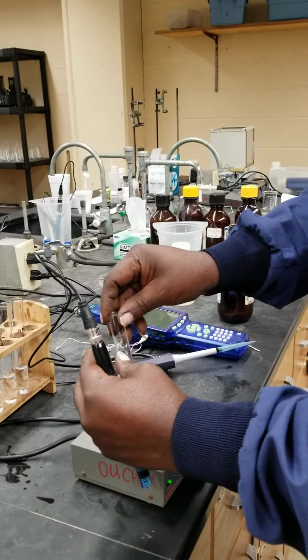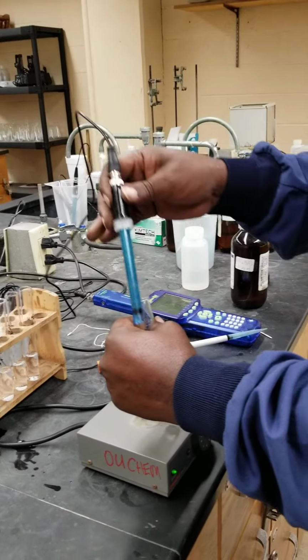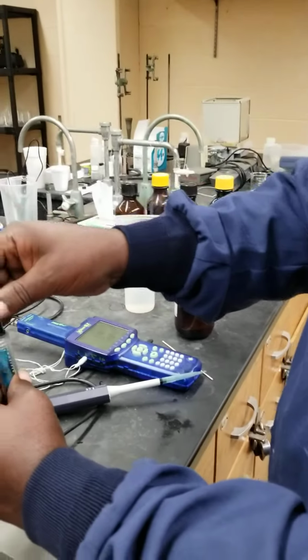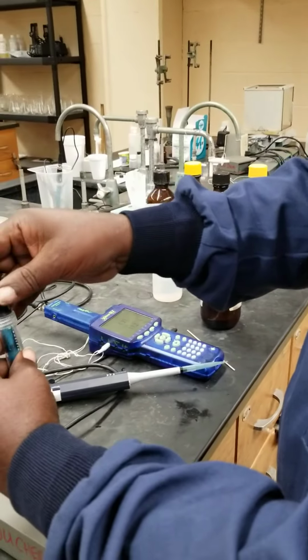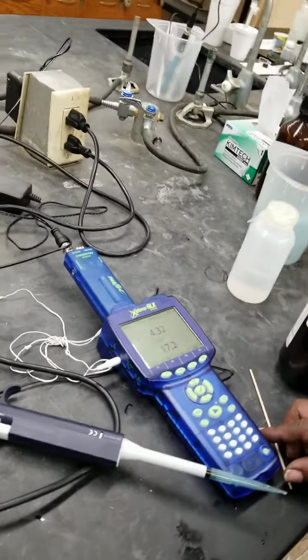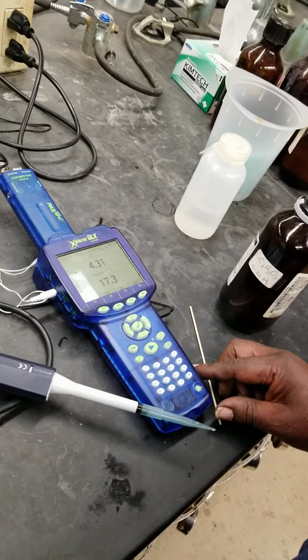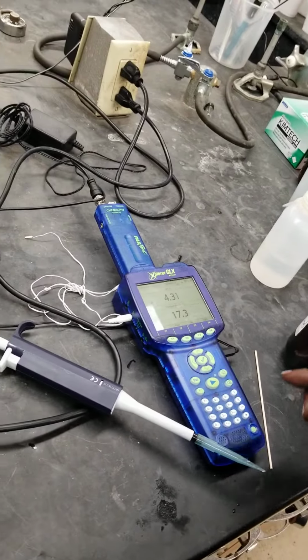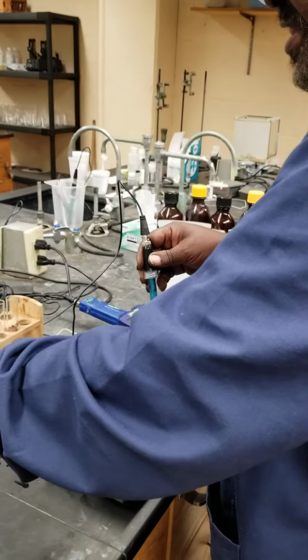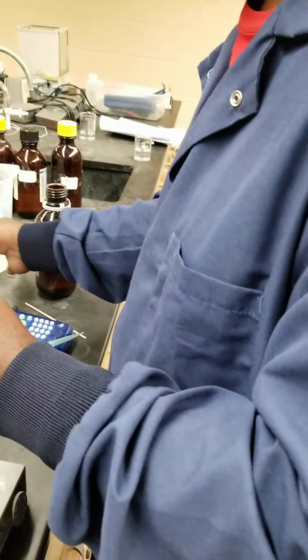Do the mixing. Turn it off. And read the pH. Let's read that as 4.31 after addition of the second 3 milliliters. So with that, we are done with the acetic acid, sodium acetate buffer.